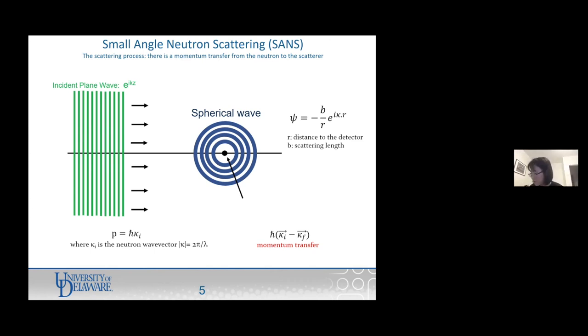Yes, and last question: what is the difference between SANS and neutron reflectometry? Okay, so you can almost think of reflectometry as a specific case of SANS, where you have your molecules aligned or structured on a surface. In that case, you're looking at a surface or at the orientation of a molecule on a surface. So the type of sample and the experimental setup is different. You'd be looking, for example, at how a molecule binds to a membrane. That's a very common application of reflectometry.